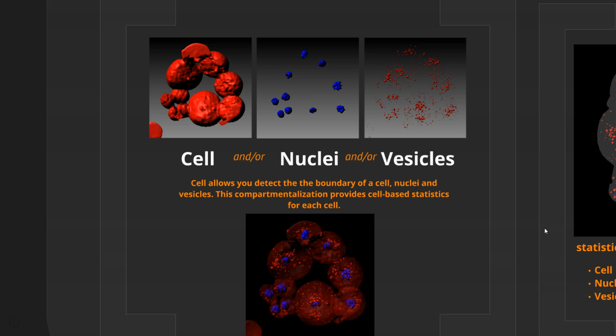I wish it was not labeled with a name, although they're trying to make it a little more biologically smart, so they're giving compartments names. It would actually be better if it was just compartment 1 and you got to name it. That's coming in the future, but for right now I just want you to know that these compartments can be used for whatever structure you want to use them with.